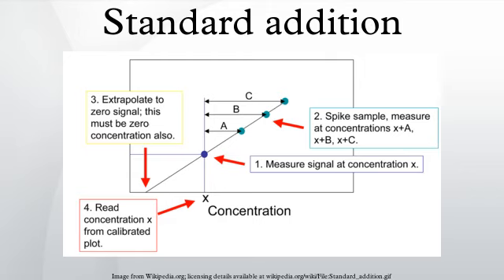The method of standard addition is a type of quantitative analysis approach often used in analytical chemistry whereby the standard is added directly to the aliquots of analyzed sample. This method is used in situations where the sample matrix also contributes to the analytical signal, a situation known as the matrix effect, thus making it impossible to compare the analytical signal between sample and standard using the traditional calibration curve approach. Applications: standard addition is frequently used in chemical instrumental analysis such as atomic absorption spectroscopy and gas chromatography.